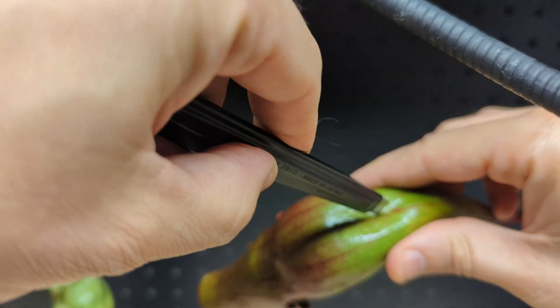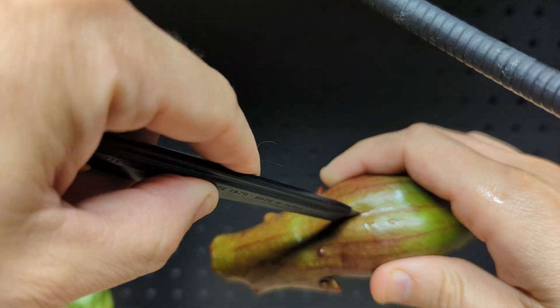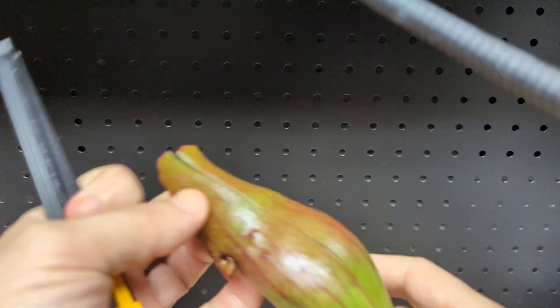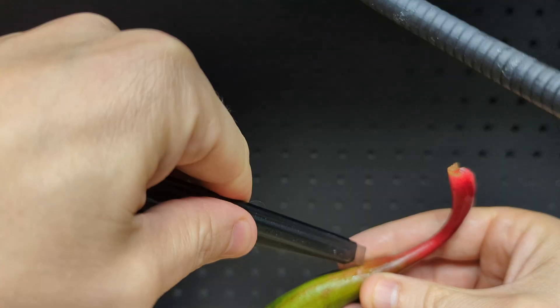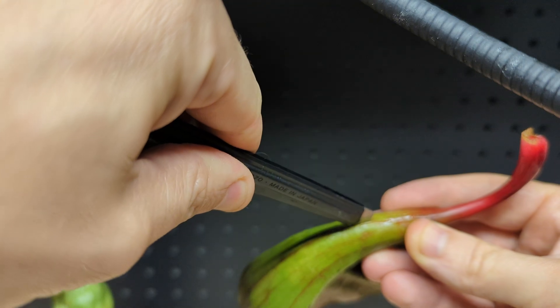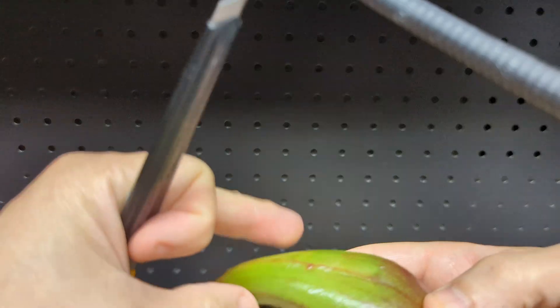Let's do our little cut here. It makes a satisfying sound. It's a really cool material — kind of spongy when cutting into it.